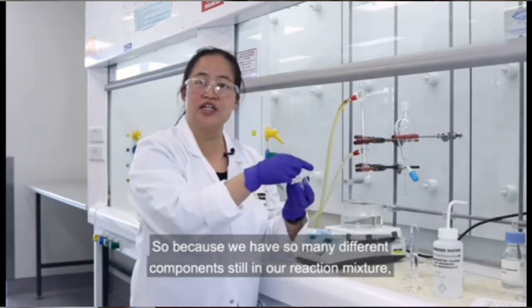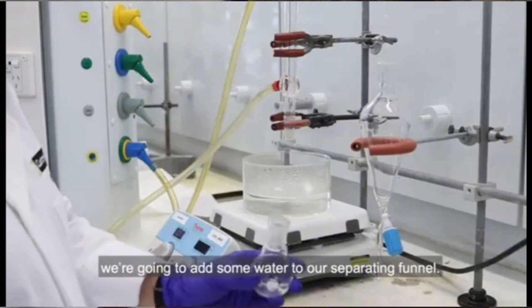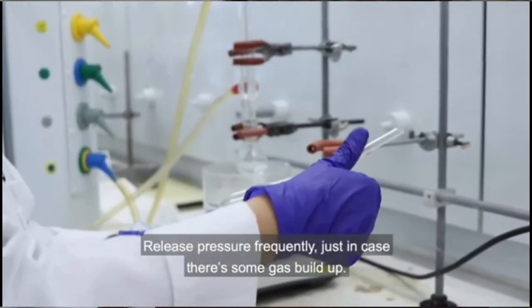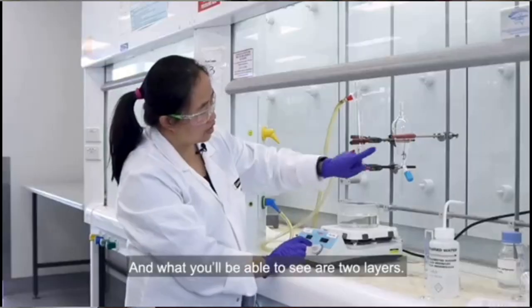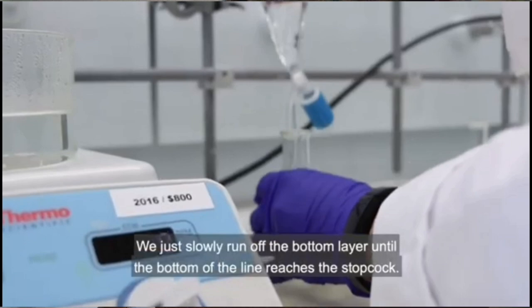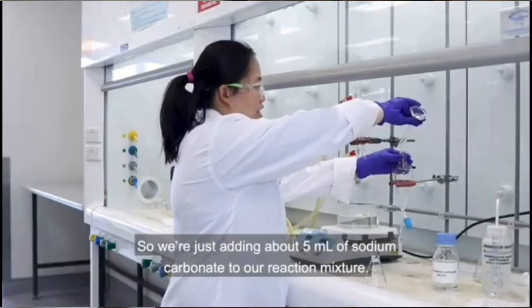Because we have so many different components still in our reaction mixture, we want to isolate our product. To do that, we're going to add some water and shake. Release pressure frequently. Then take the stopper off. What you'll be able to see are two layers, a bottom layer and a top layer. We'll just slowly run off the bottom layer. There we go. The next step is we're just adding about 5 mils.